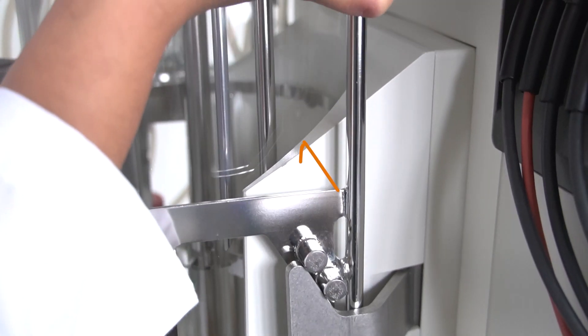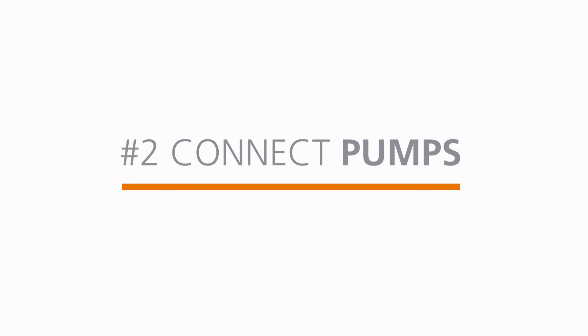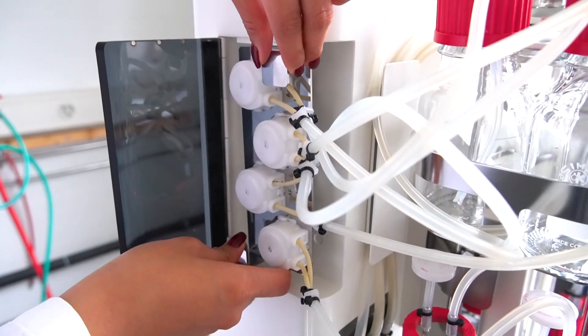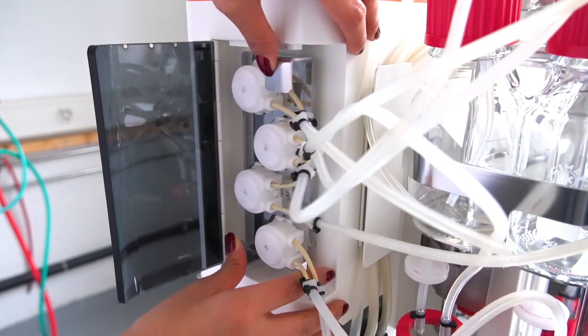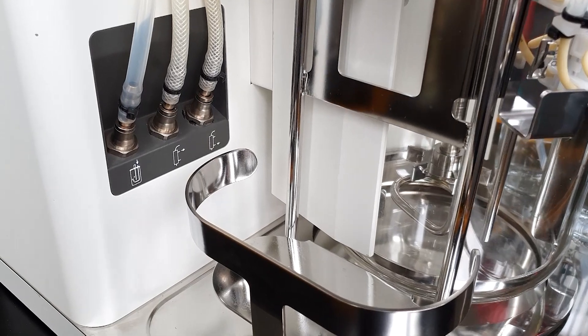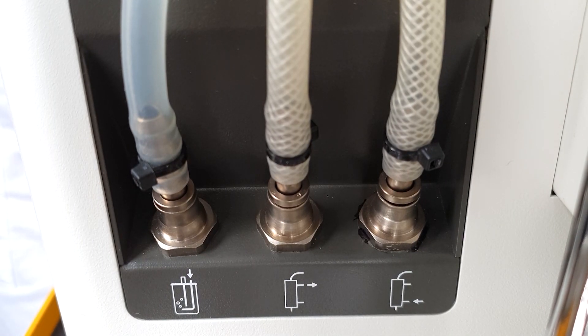Make sure that there is no gap between the tempering block and the glass vessel. You will get pre-installed tubings for the gas inlet as well as tubings for the exit gas cooler.